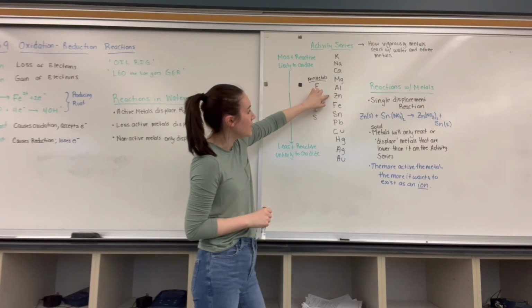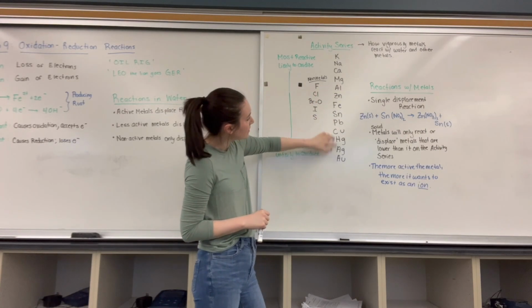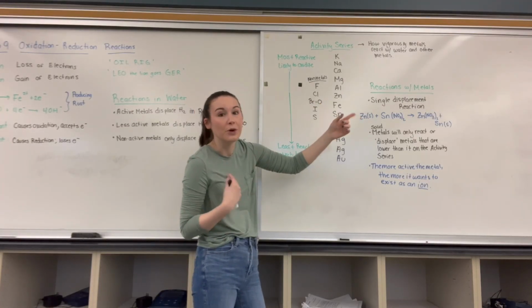Zinc solid is our solid metal. It will react with all of these metals. Since tin is in there, it will react with it, and this reaction will occur.